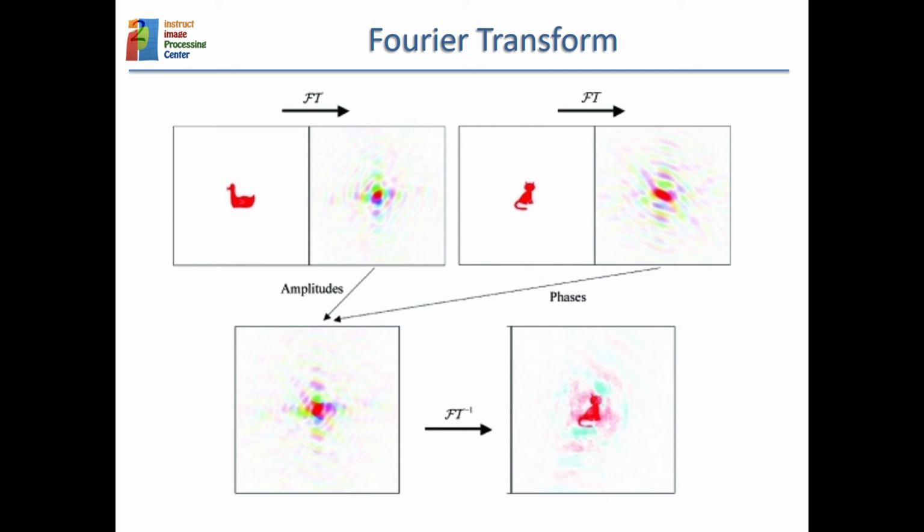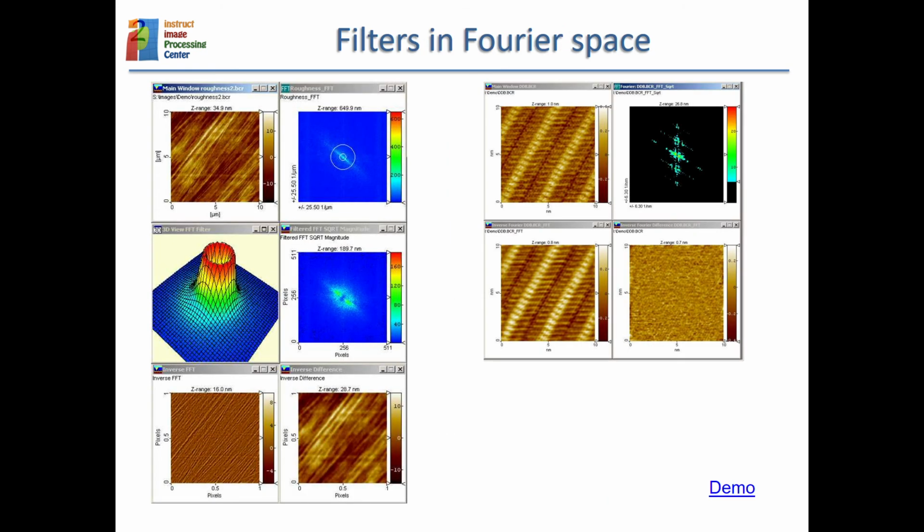So we saw before that our signal to noise ratio was somewhere between 1/10 and 1/100. So that means that we have 10 or 100 times more noise than signal. Okay, but once we understand that, we may try to define operations in the Fourier space that are helpful.